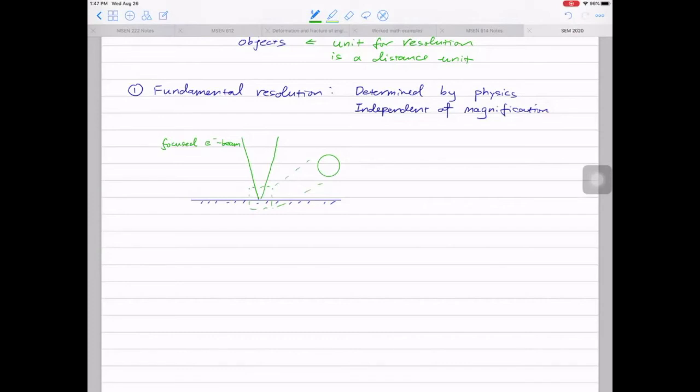The disk is called the Airy disk. When we show the slides, we will have more information on that. Let me ask you, why can you not focus any beam, either an electron beam or photons, the light beam, into a single point? Why do you get a disk instead of a point? Because it's always a wave. Exactly, because you always have the duality. Even electrons themselves are waves. You cannot converge something smaller than its wavelength. That's why you get a disk. Very good. Too bad I cannot give you the chocolate.